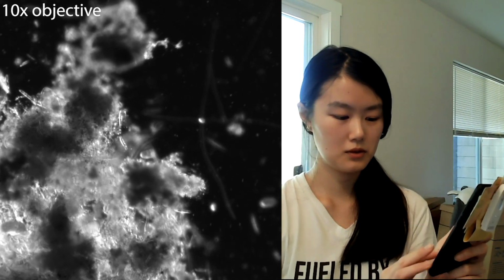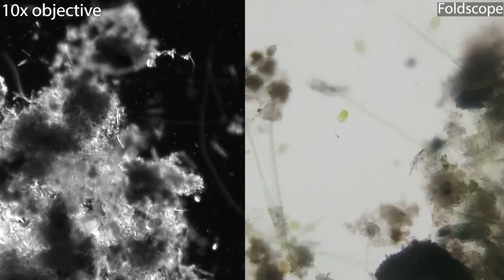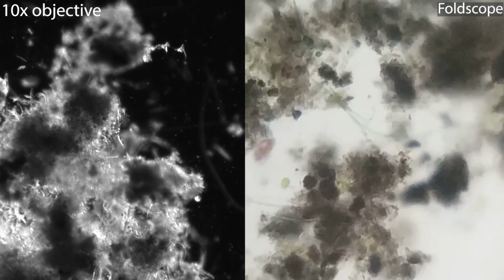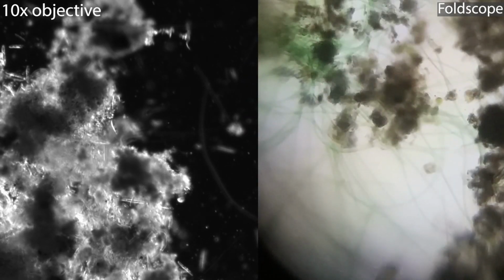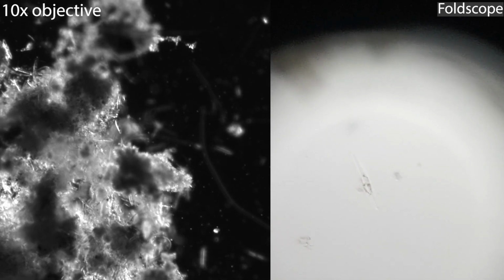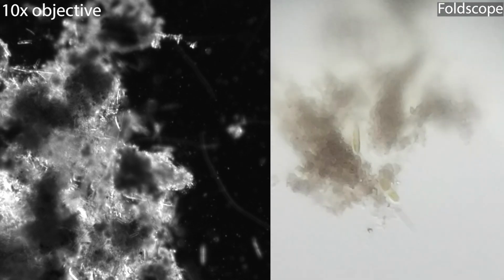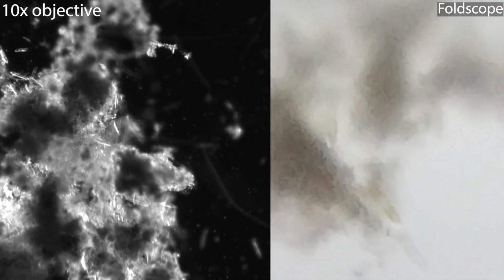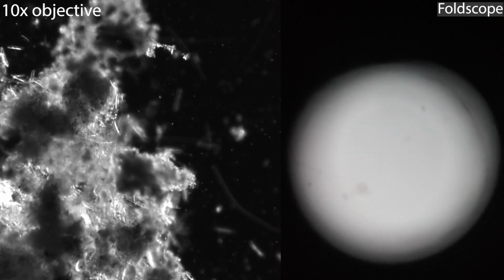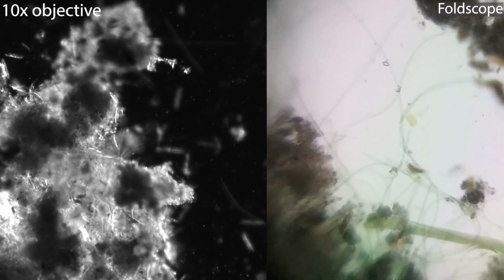All I need to do is go to my camera app. Now I'm gonna put up this video on the screen. You will no longer see me trying to carry the camera. Oh wow, so now under the Foldscope there's color. So keep in mind that compared to a lot of water, we now only have one little drop of water. There's a swimming thing. But did you see how, I think that was a diatom. Yeah, so there's a diatom. Ooh, but something is swimming there. Oh look, there's a diatom. Those round little cute things we saw actually look orange. Aren't they so cute? Wow, look at that. They're really fast. So maybe the strategy is to just sit at this one spot and watch them as they come by.